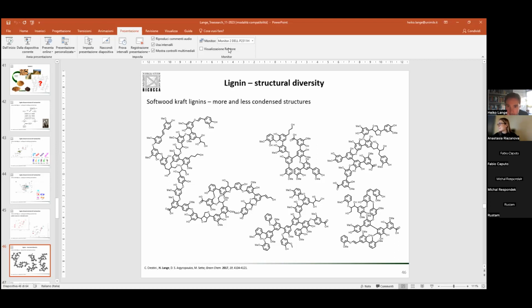Thank you very much, Heiko. Amazing lecture. I have a question about fractionation. You mentioned your dialysis packs. So generally, comparing other methods for fractionation of lignin, for example, using different solvents or an acidic, pH-based method.